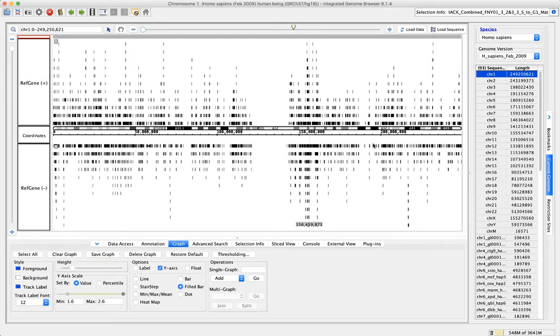Once the data has been added to IGBI, make sure to select a region of interest and then click Load Data to load the data.